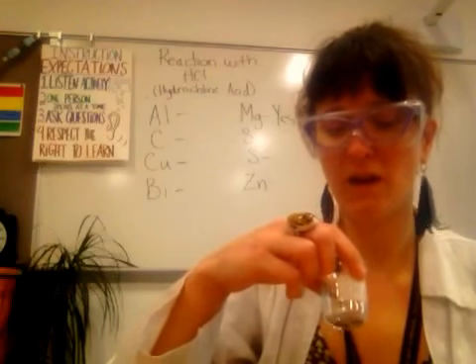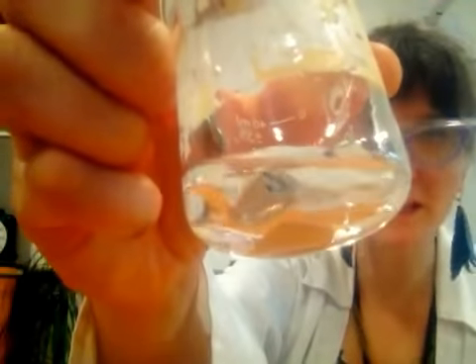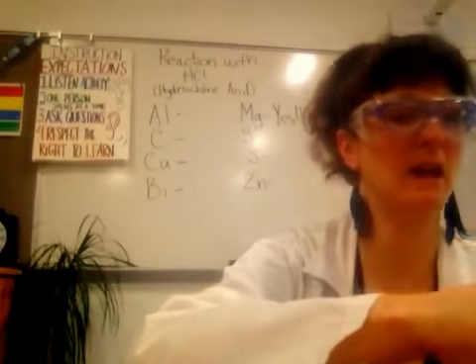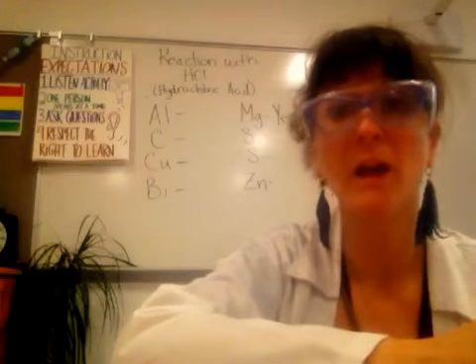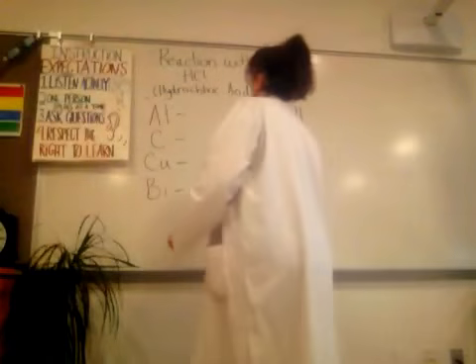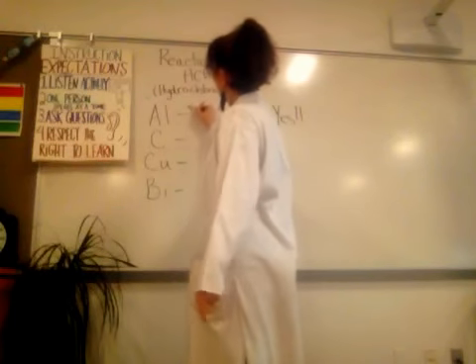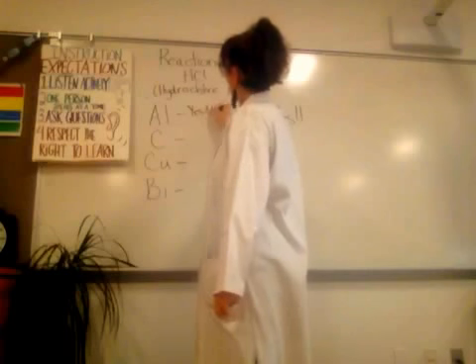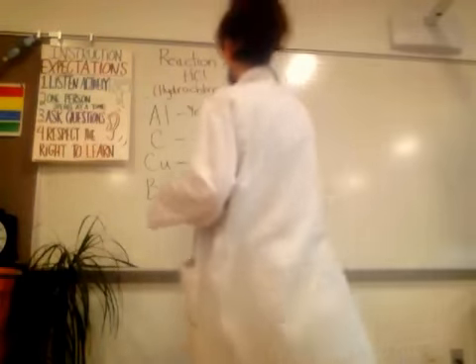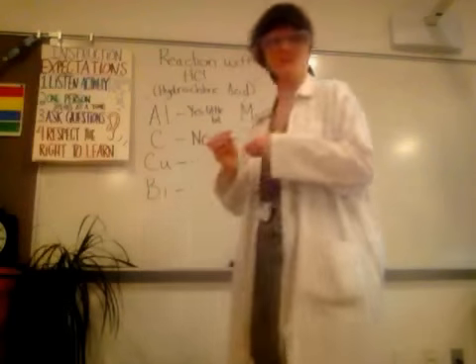There are very, very little tiny bubbles happening in this one with aluminum. Very little. But because there's just a small amount, it still would be considered to be a yes, which I'm going to write up at the board here for you. But you go ahead and maybe write either yes, really small, or a yes and it is a little bit. Then we've got the carbon. The carbon, still nothing happened, not even a single bubble, so we're going to write no.